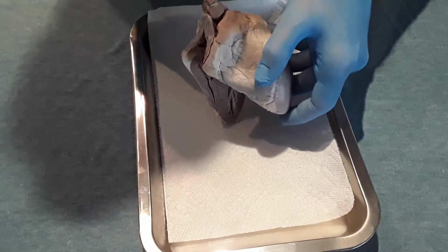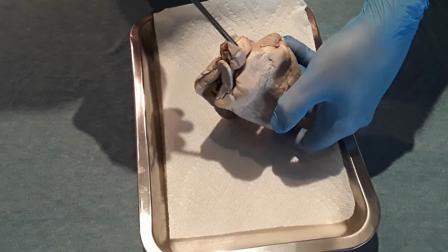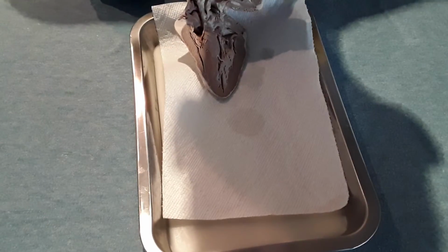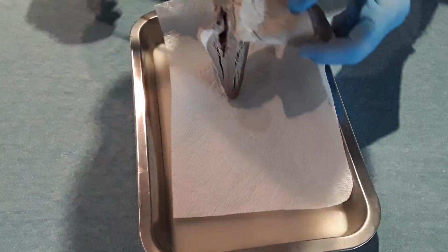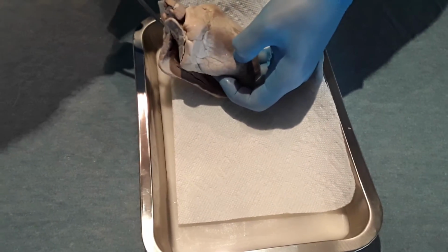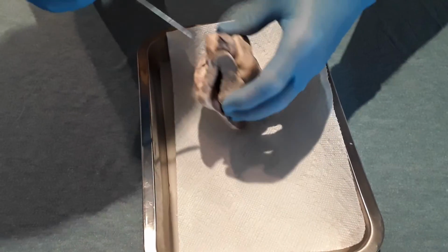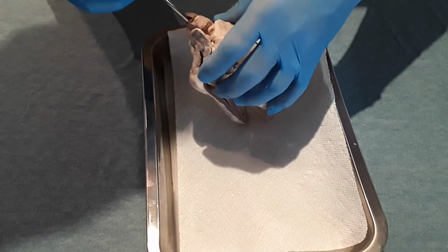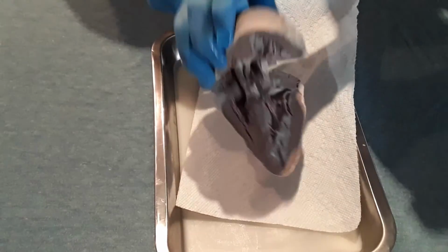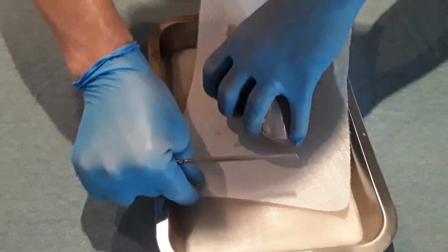A couple of things here real fast. There's one of the vessels. This is actually the superior vena cava. It goes into the right atrium. And this is the aorta. It comes from the left ventricle. Thank you very much. That's my list of terms.